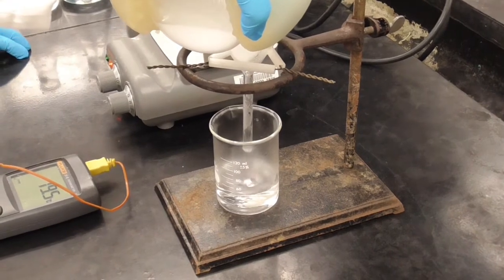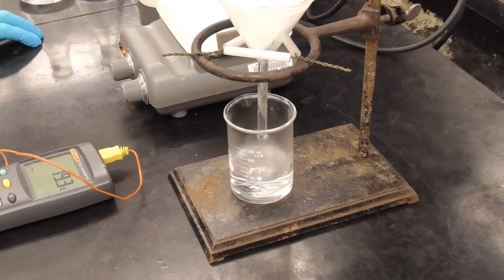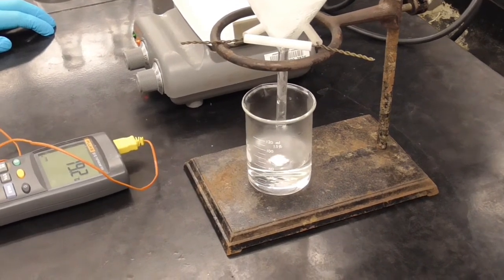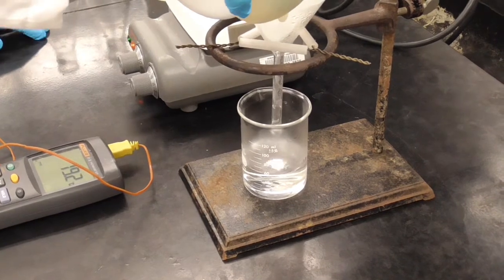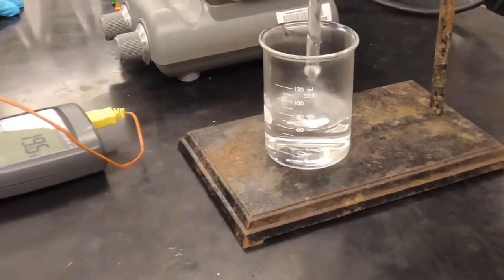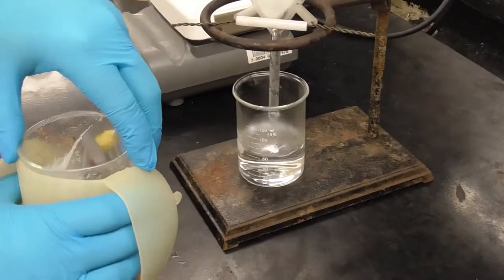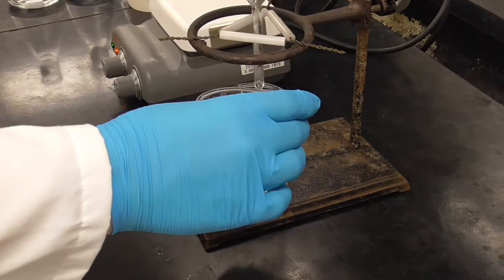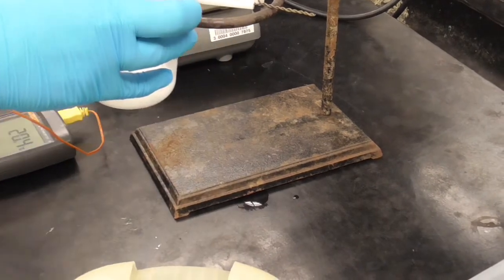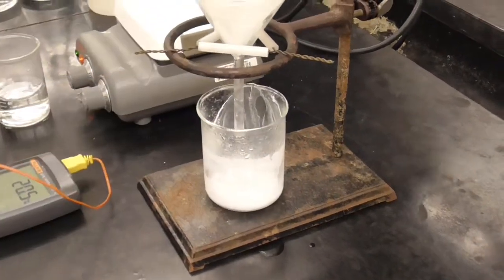So we're going through here. Okay, so according to the beaker measurement, we've got 60 milliliters, which should be plenty. So what I'm going to do is swap this out. Because we don't really need any more than what we have, we're just going to let this sit and drain the rest of the way.